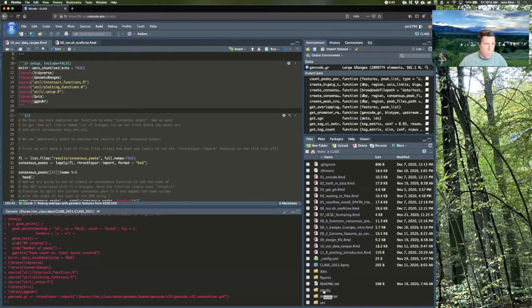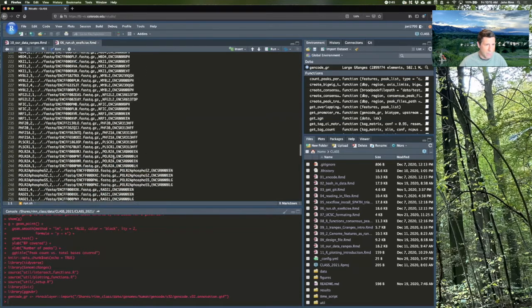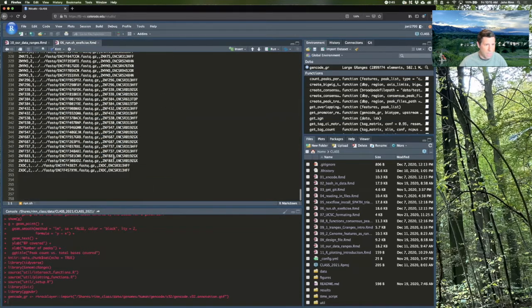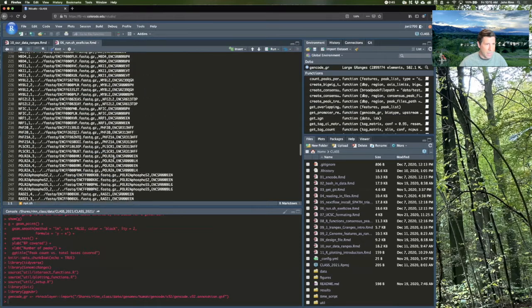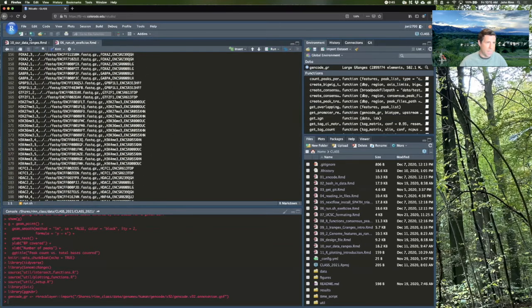If you're running this from home, I don't recommend running all of these. I might pick a subset and you can follow along with the rest of the course with all of these, but it'll take a long time to run, and you have to watch it and make sure there's no errors and restart it. So that took about 4 days to run.